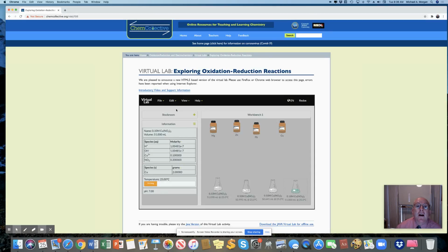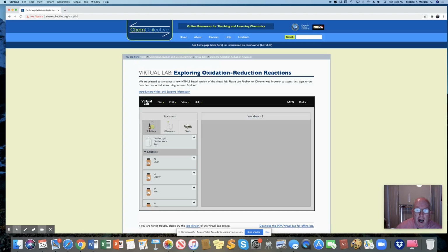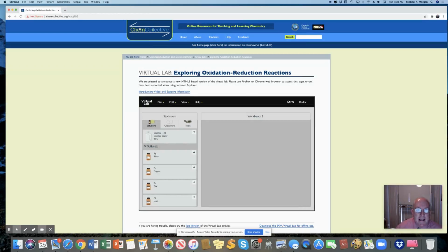Okay? Now, a couple other things that are important to know. Up here on Edit, I can go through and remove a solid, remove a liquid, etc., but I like this one. Clear the workbench. I've got a nice fresh workbench. I can start over again. Okay, so really important. This is the Chem Collective website, okay?